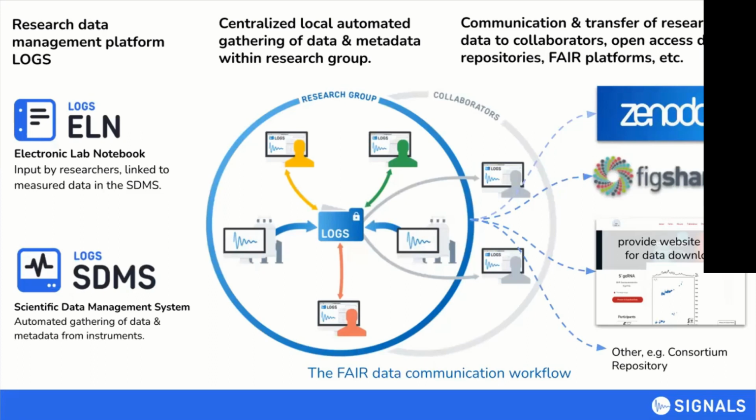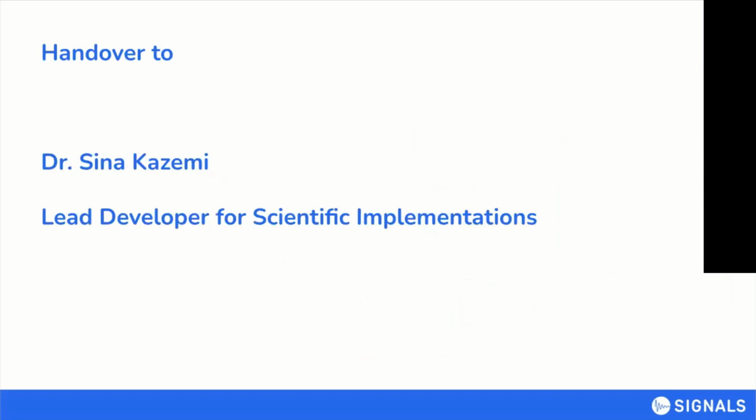I've already asked Nicole Jung about the API. If possible, we want to connect the scientists with the necessary platforms, starting with their machines, with their instruments, and then even enable them to do their ELN entries and maybe link that or not. And then I think we've come much further than we were maybe 10 years ago when we had this idea about LOGS.